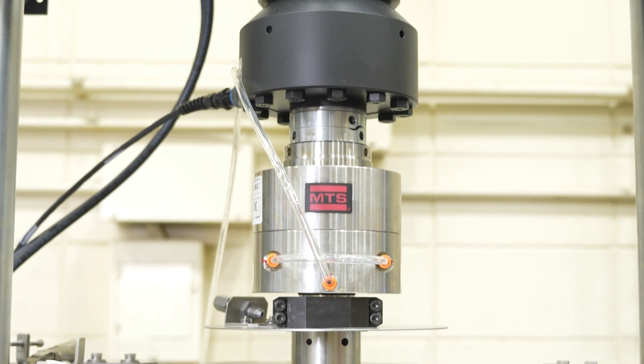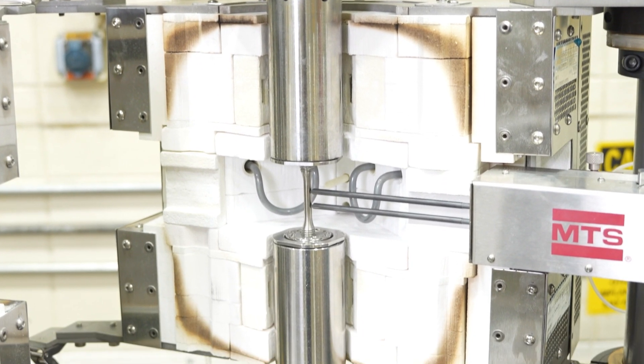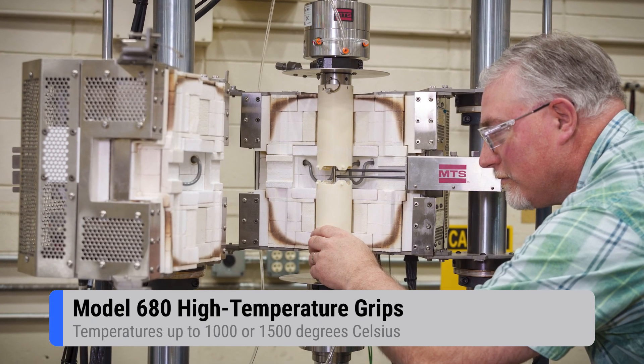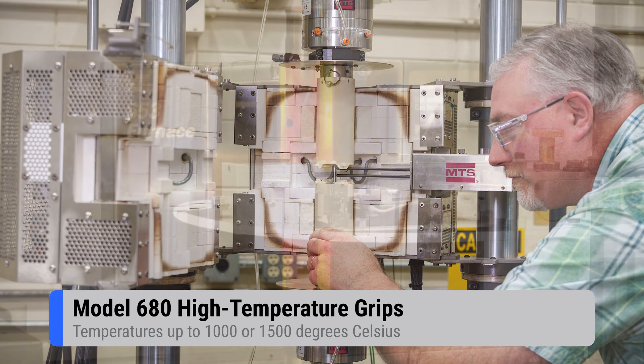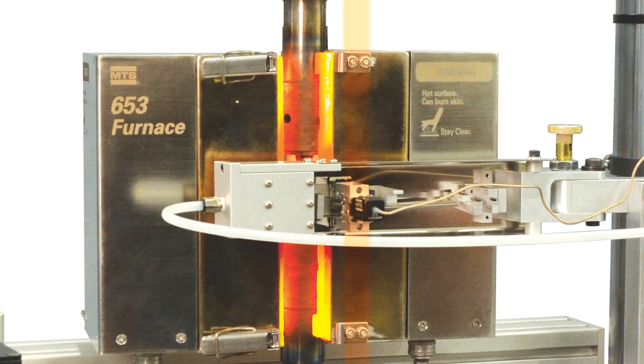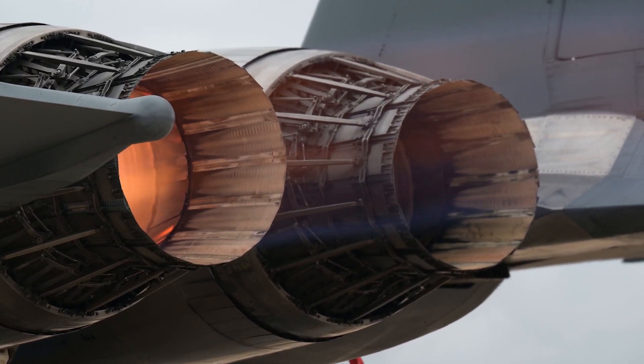Looking for a hydraulic grip that can support static and fatigue testing at temps up to 1500 degrees Celsius? The patented MTS model 680 high temperature grips provide accurate results at temperatures up to 1000 or 1500 degrees Celsius, making them the ideal choice for testing temperature sensitive materials.